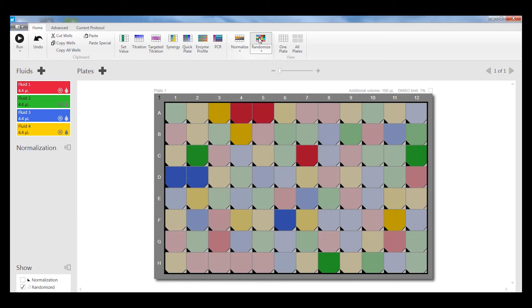In a subsequent video, we'll show you how to de-randomize the data using a separate application called Data Merge.